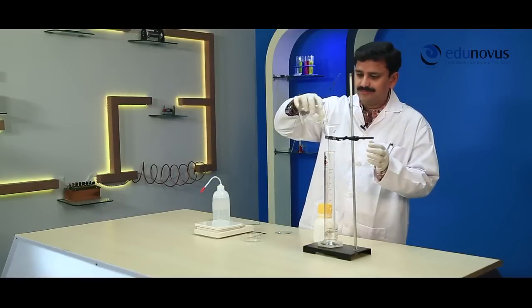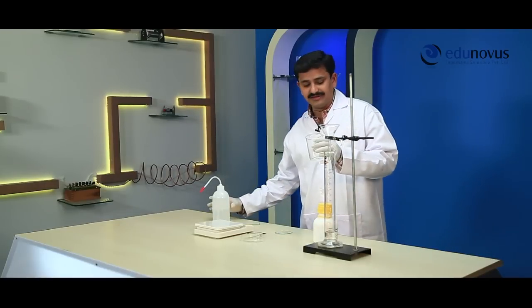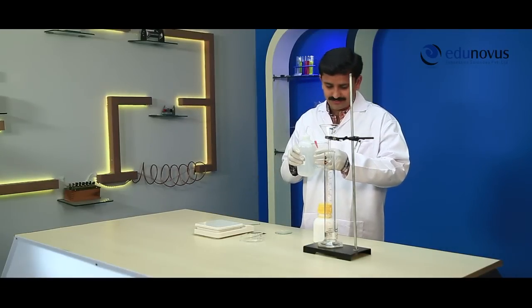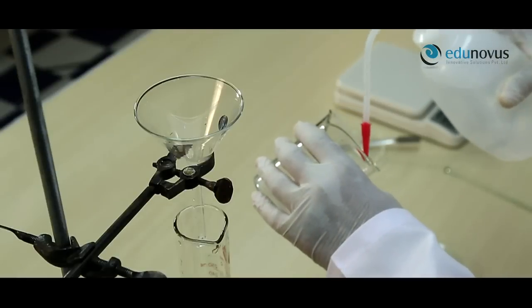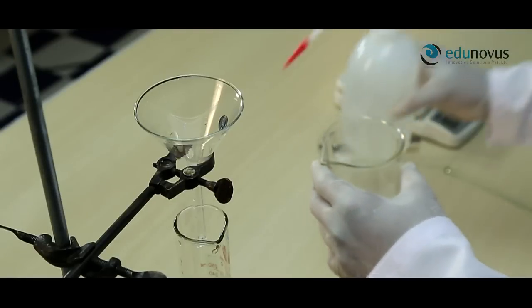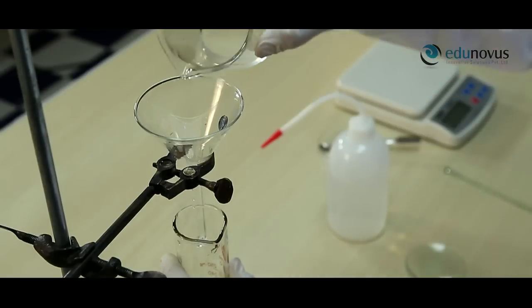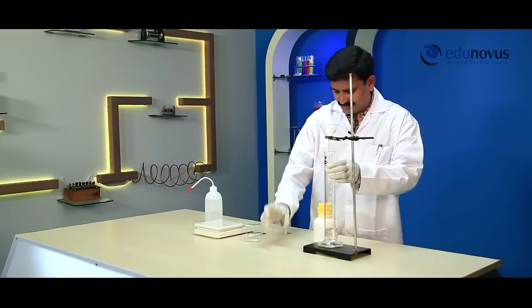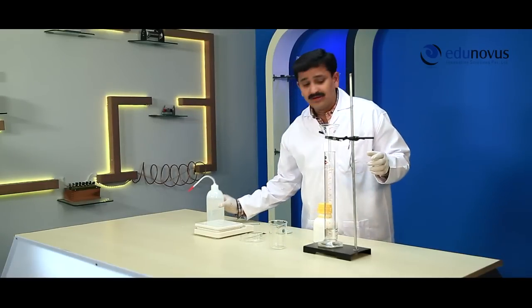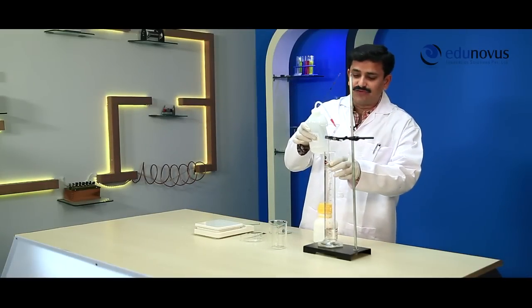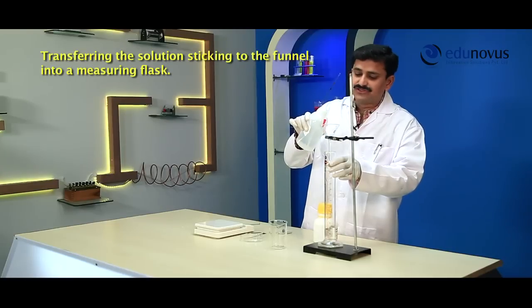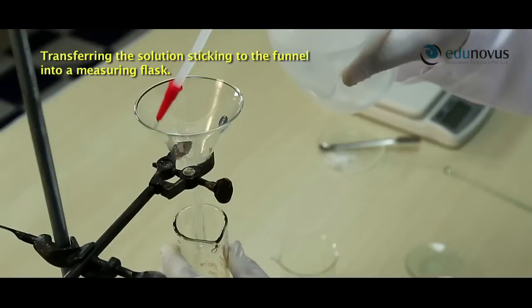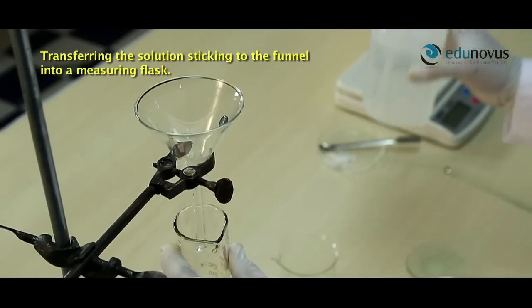After that, wash the beaker with distilled water and transfer these washings into the measuring flask. And also wash the funnel with distilled water so that the solution stuck to the funnel must be transferred into the measuring flask.